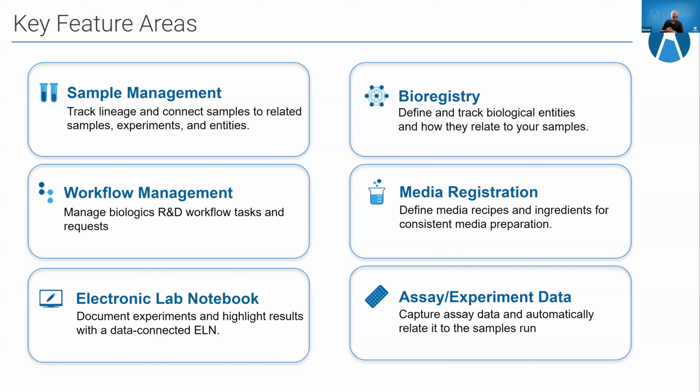You can really cut down on time spent authoring by making use of full fidelity templates and further simplify your lives with collaborative authoring. My favorite example of collaborative authoring is what I see often done by teams of cell line development scientists, who are part of, say, a single epoch of work operating in shifts to care for their cells, keep them alive, passage them, take measurements of their viability and density, things like that. And in our system, you can compose your portion of that work stamped with the different days you were involved, and have it all in one place, request only a single review of the whole document, and really streamline the process.